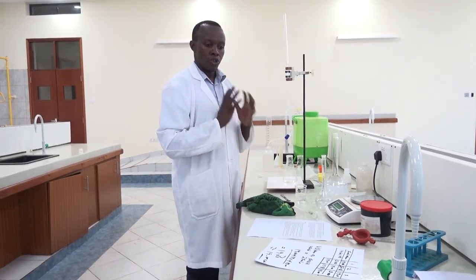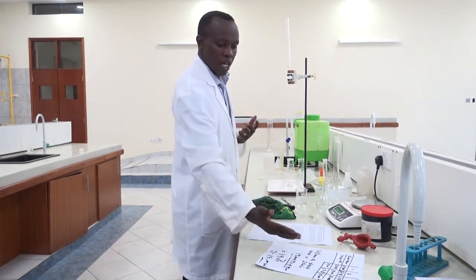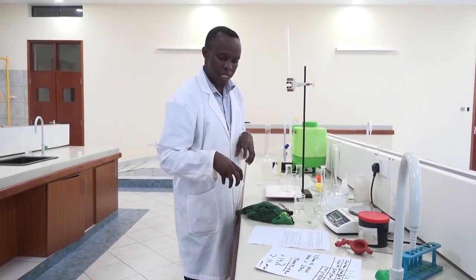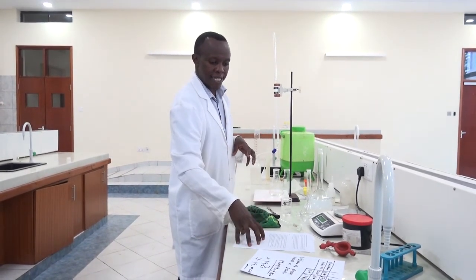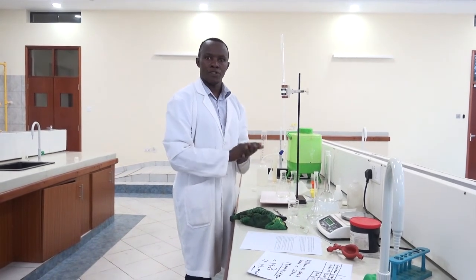sodium hydroxide used. Having obtained the moles of sodium hydroxide in the volume that was used, I used 25 mils of the sodium hydroxide. So since I have the moles of HCl, which is the same as the moles of sodium hydroxide, and those moles of sodium hydroxide are in 25, I can now simply calculate the molarity of the sodium hydroxide by having this expression. The moles that I obtained for the acid is the same as moles of the sodium hydroxide, and the moles of sodium hydroxide are in the volume that I used, which is 25, per 1000. From there, I'll now have obtained the molarity of sodium hydroxide, and the aim of the practical will be achieved, because I have been able now to get the molarity of sodium hydroxide. Thank you.